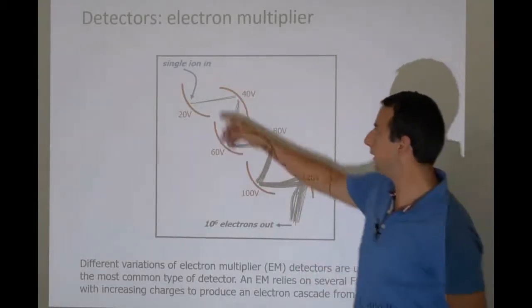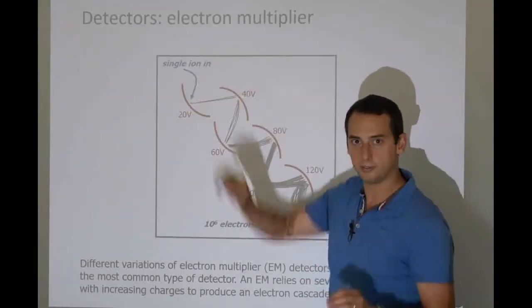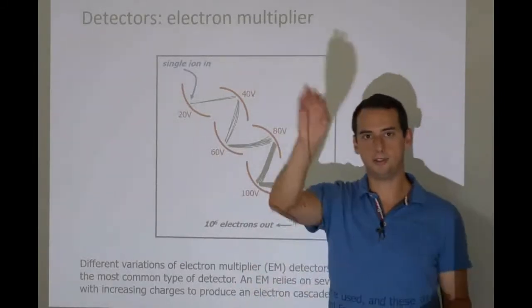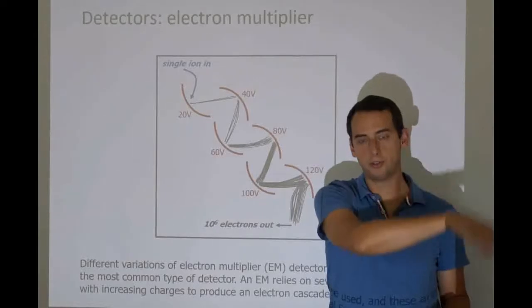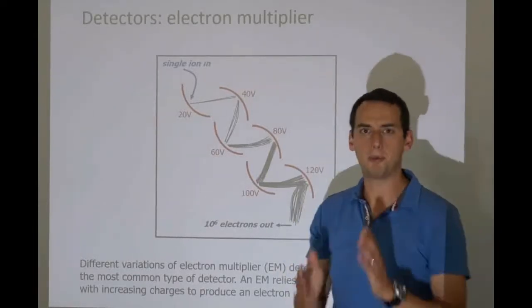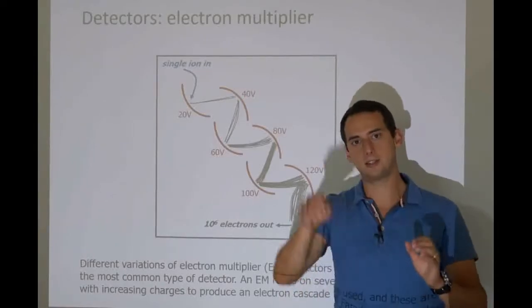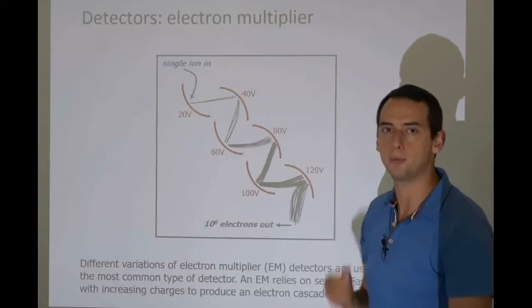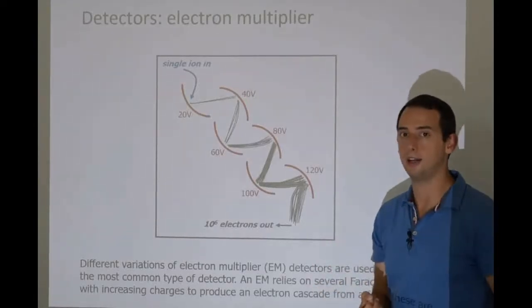So the idea is that you take a small signal, very, very weak, undetectable, but you actually make it into a detectable signal that you could see on an oscilloscope, which is essentially what our detectors are. They are oscilloscopes, and then remember there's a digitizer that scans this oscilloscope over time and gives you a fairly good idea of what happens when, and the faster it does that, the higher the resolution.